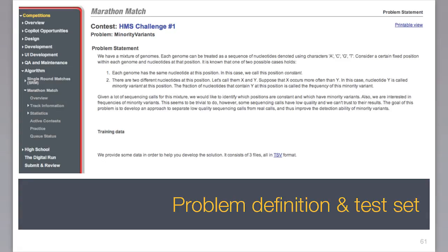Look, we are trying to reassemble a book, a text. We have fragments that have a certain error rate. For each position and for each fragment, we have all those different metrics that we can make available to you. Your task is to distinguish true variation from any kind of noise that might be in there.